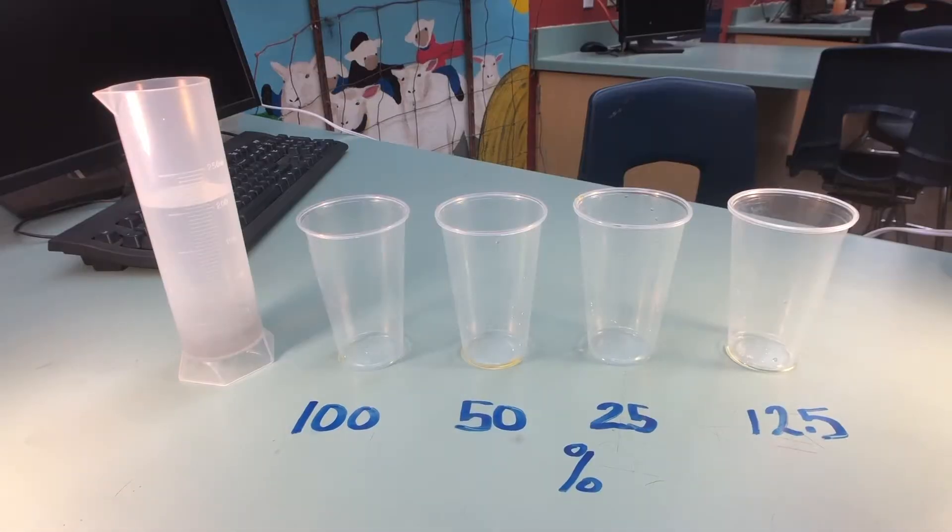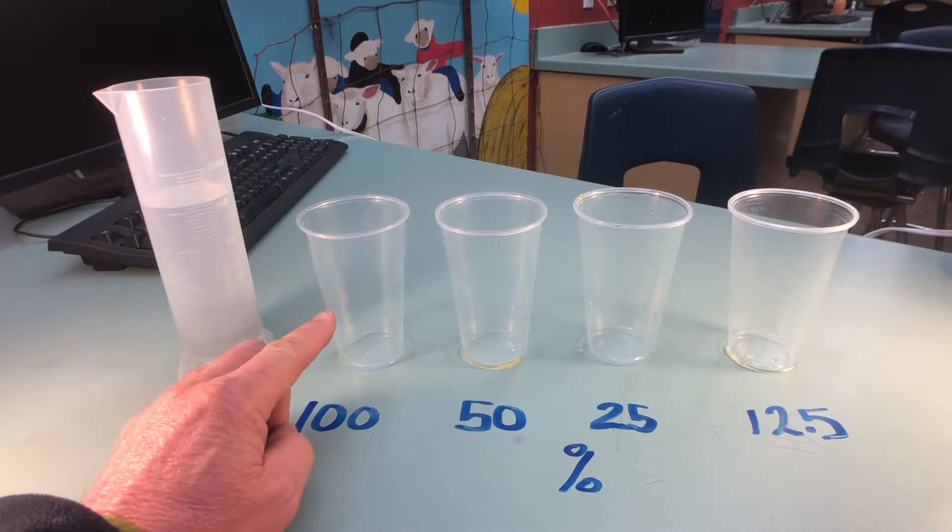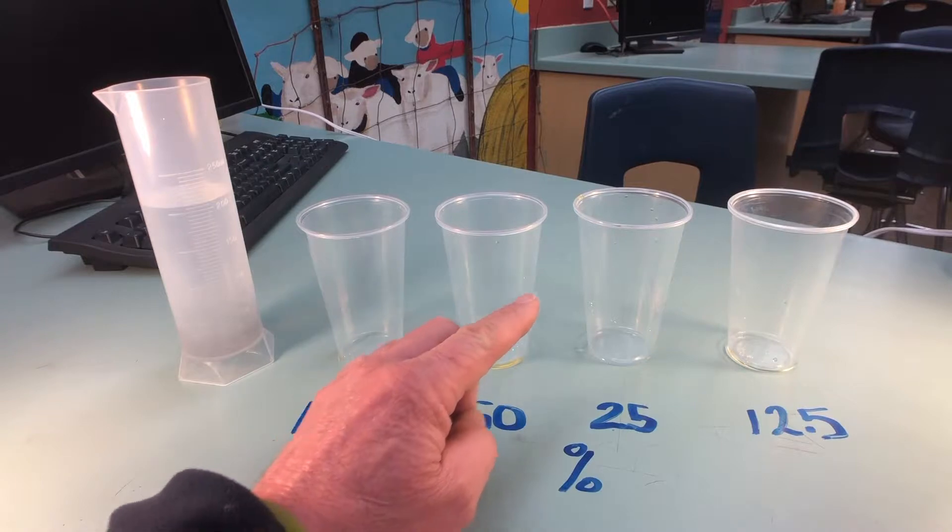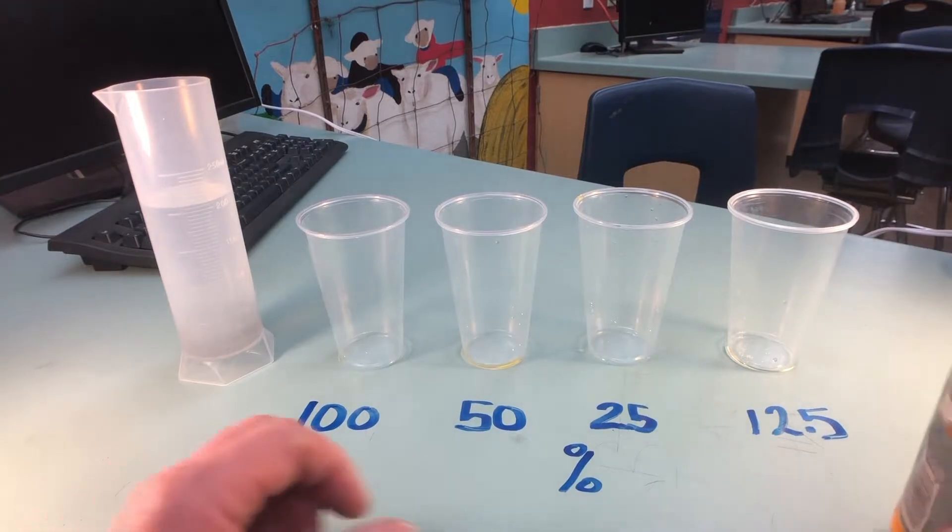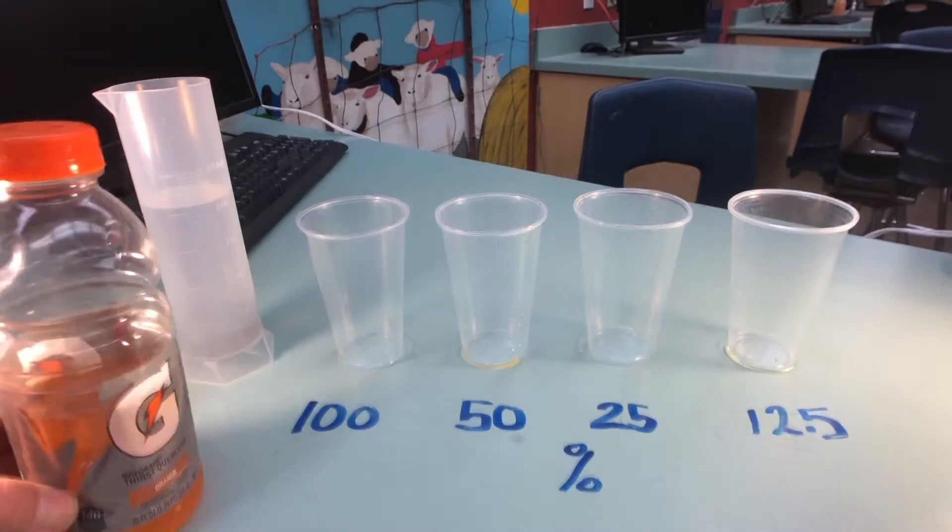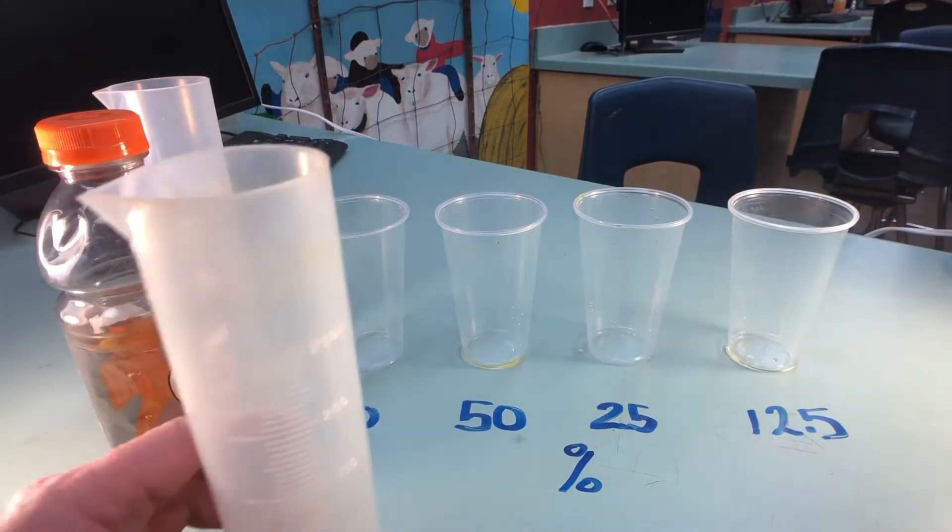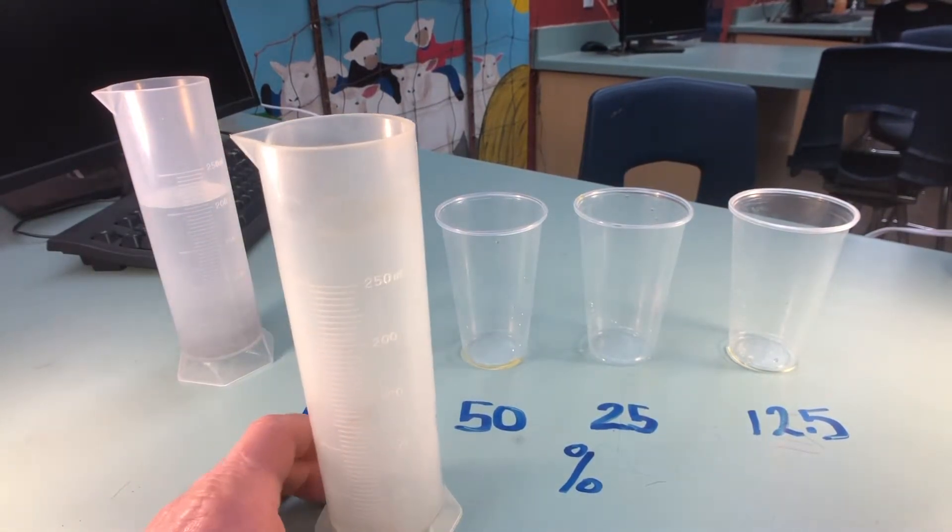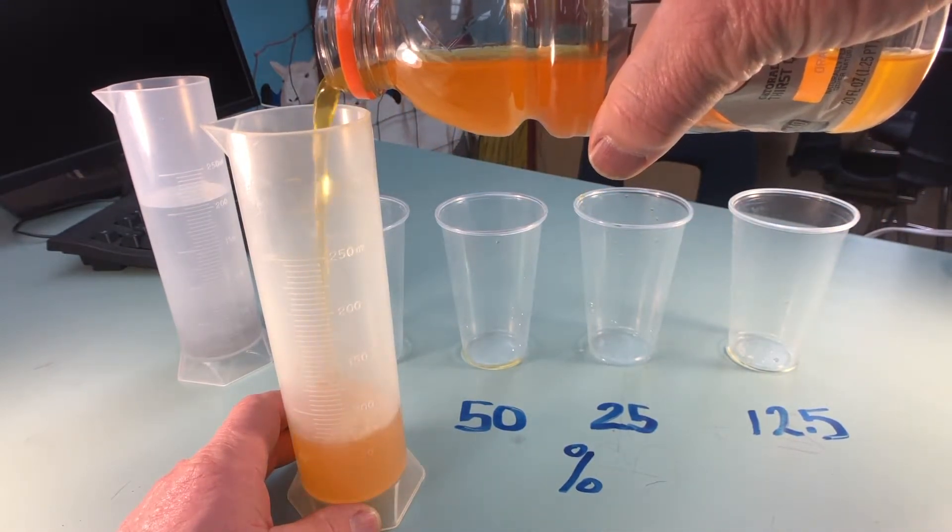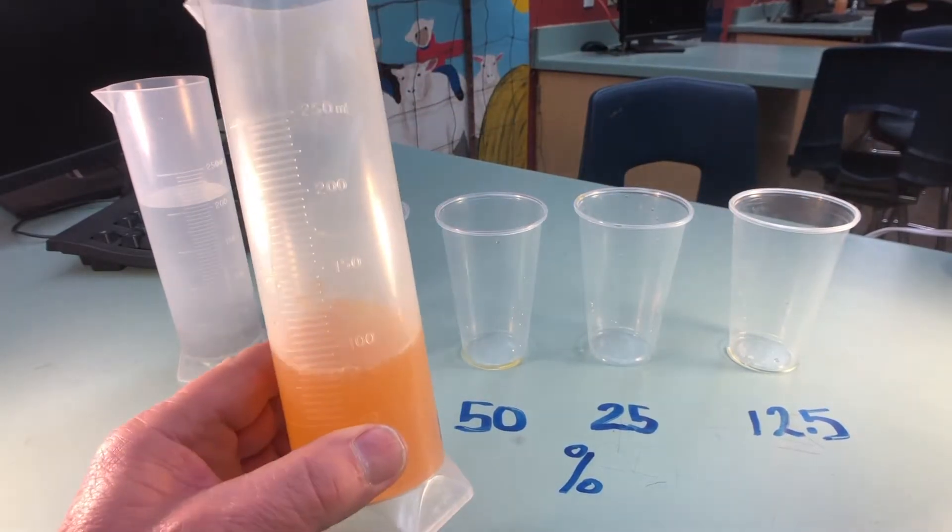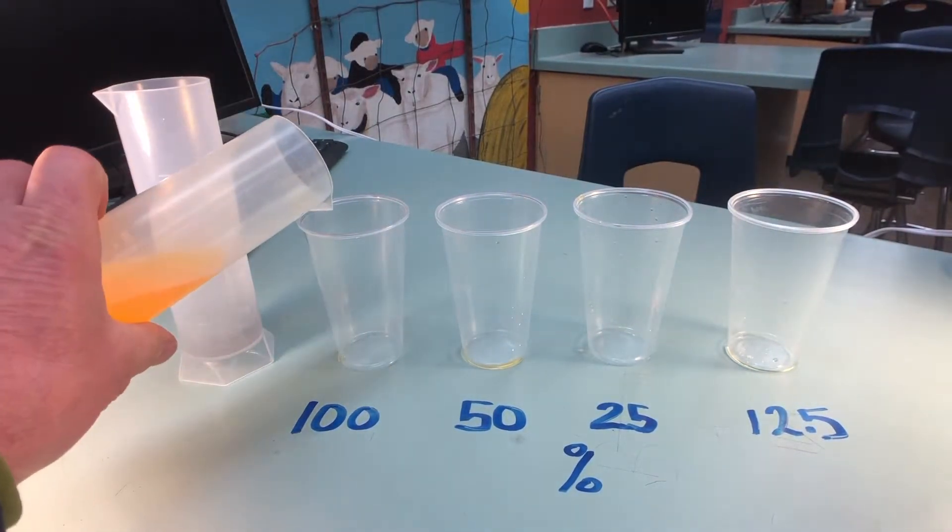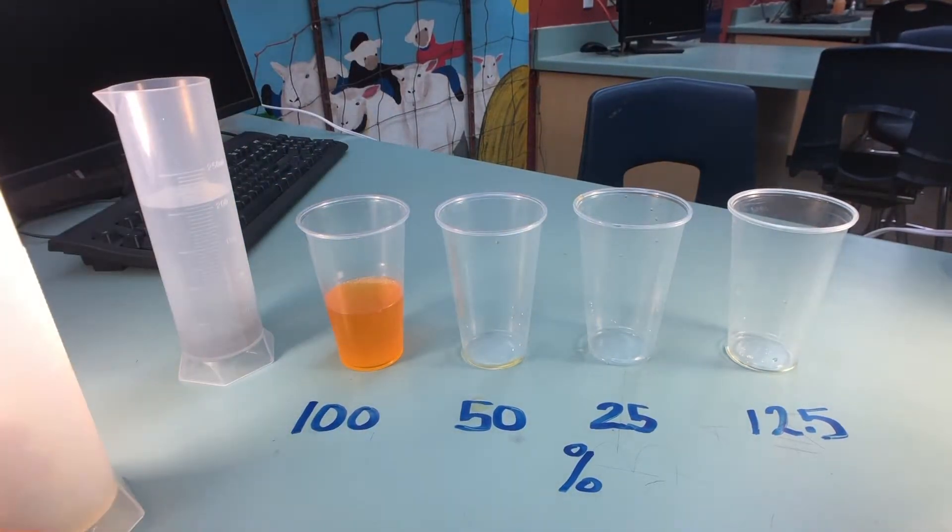Before we actually get started on the lab we have to serial dilute each one of these containers. One with 100% solution, 50% solution, 25% solution, and then lastly 12.5% solution. To do this we're going to be using Gatorade. We're going to be putting 100 cc's or ml's into the 100% container. We're going to be using graduated cylinders to do that. To start with I'm going to go ahead and put 100 ml's of Gatorade in the container. And we're going to just pour that into our vial or flask or in this case just a cup. So 100 ml's will go in the 100% solution.